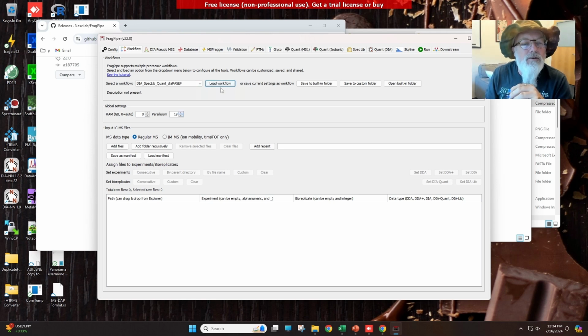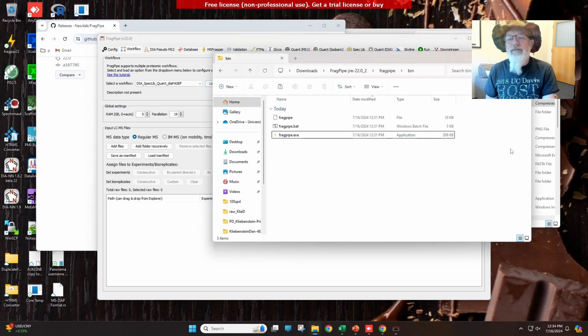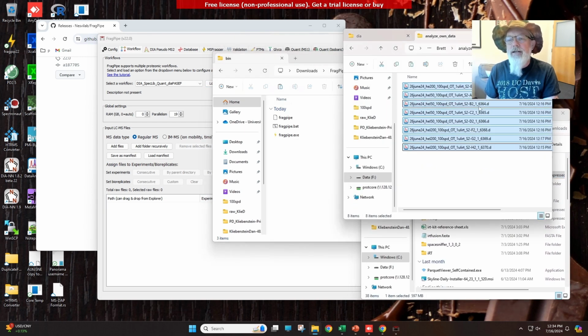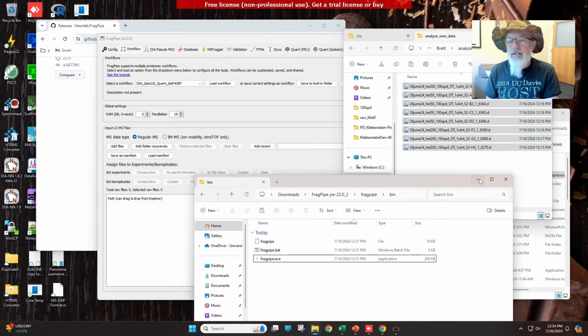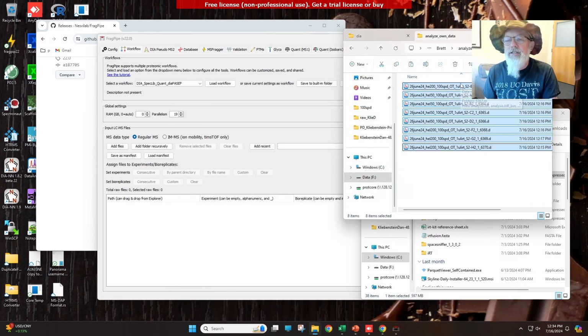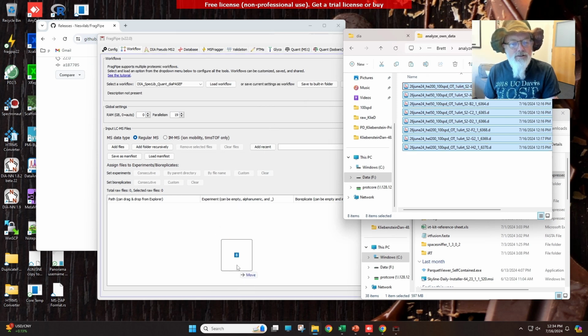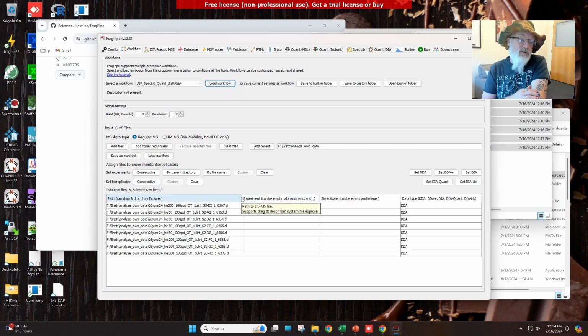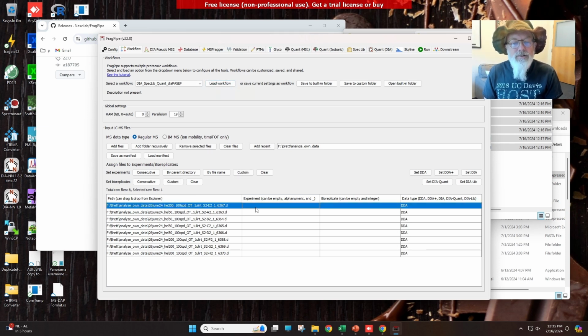All right. So now we're going to load our raw .d files. These are timsTOF files, and you can download these from our BioShare. But these are the ones we're going to use for this example, and there's 8 of them. You can just drag them into here. These are a series of just really dumb HeLa lysates that I ran, some at 200 nanograms and some at 50 nanograms, because I wanted to make a video on normalization and what the normalization does and how it works. So this will be a good, not great example.